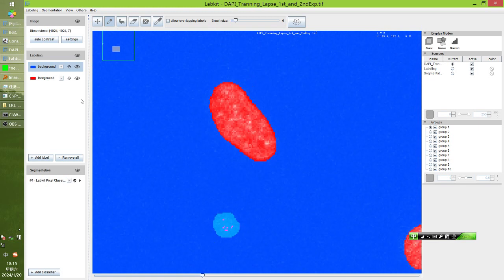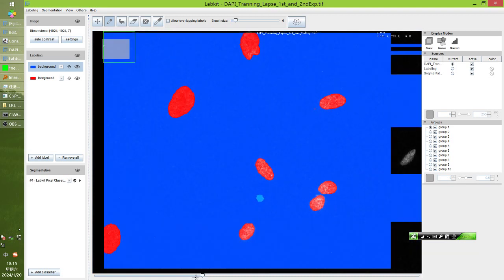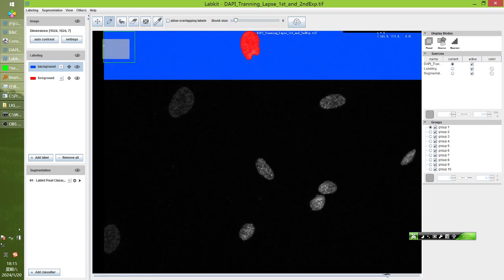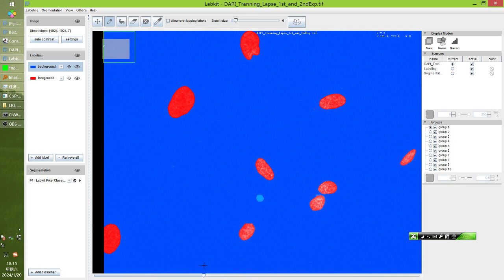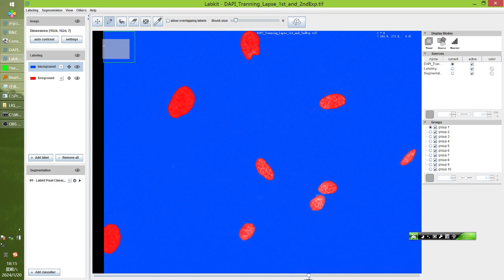Train again. It is much better now. So every time we update the training, we always go from first to end to check and make sure that they are as correct as possible for the whole history of our experiments, to make this classifier stronger. And when we are satisfied, we must save the labeling.